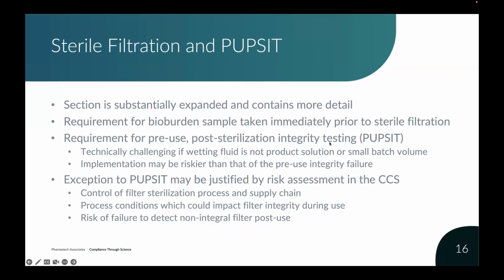Now, there are only very specific situations where that may happen, where either the processing conditions or the product itself may plug the filter or distort the filter in some way, so that even though the filter shows as integral at the post-use, it was not integral during use. So that's where some of the concern has come from that has driven this PUPSIT methodology.